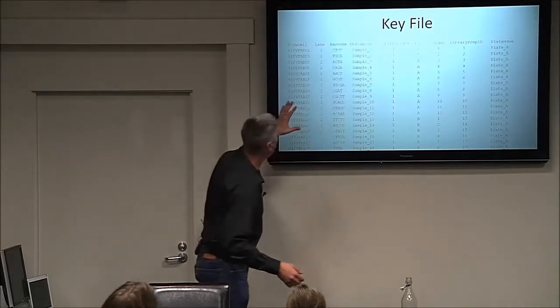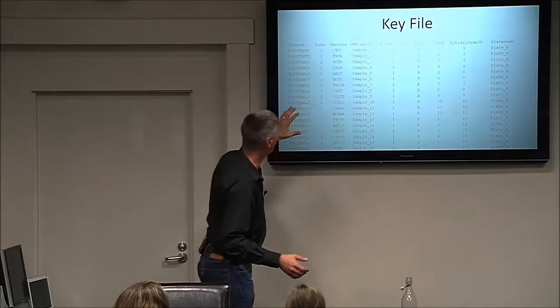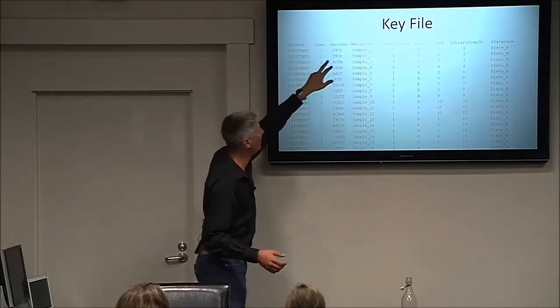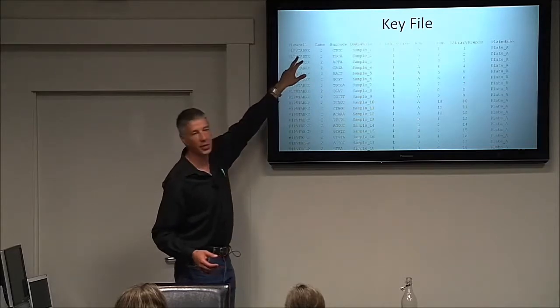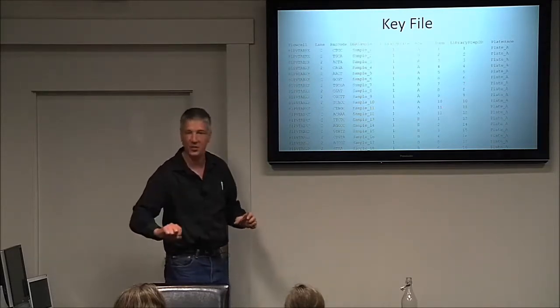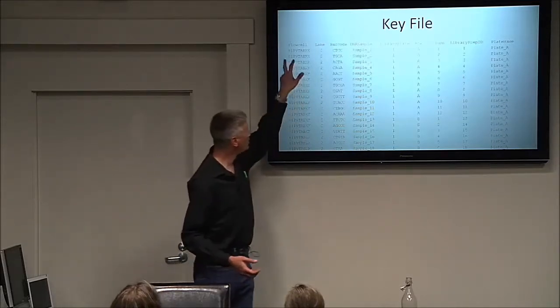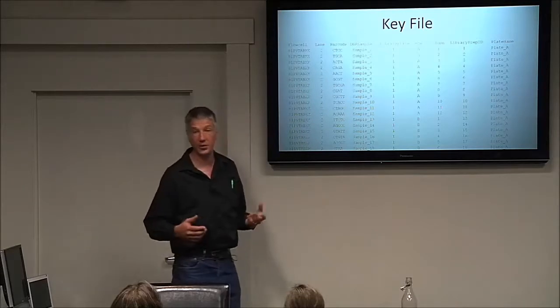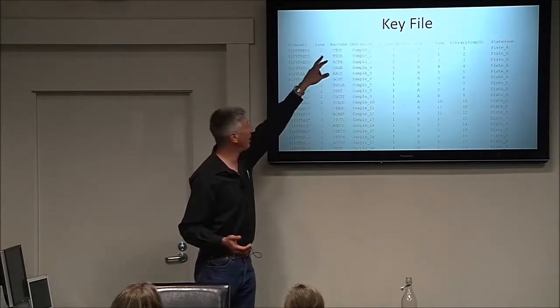Okay, so what makes a unique sample? What in here helps you identify the sequence and put it back? Well, there's the barcode, that's one thing, right? But also this flow cell, which comes from Illumina. They have a stamp on there that says this is the flow cell name. It's read by the machine and is incorporated into the file. So you've got a flow cell, and we know that there are 8 lanes on a flow cell. So within a lane, this is the lane.